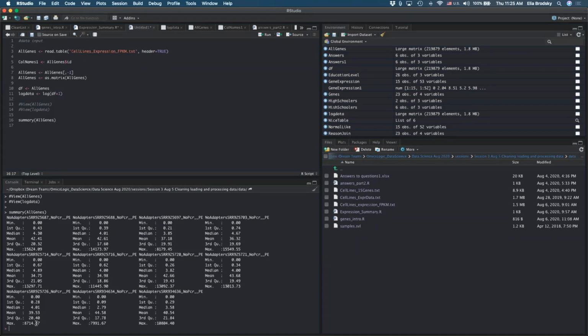So my maximums are very different. And if my maximums are very different, right, if I just take some maximum gene, it can already have a lot of variation just based on something that I don't think is representative here of the biology. But this information is hard to read. It's just numbers, and I just see one number at a time.